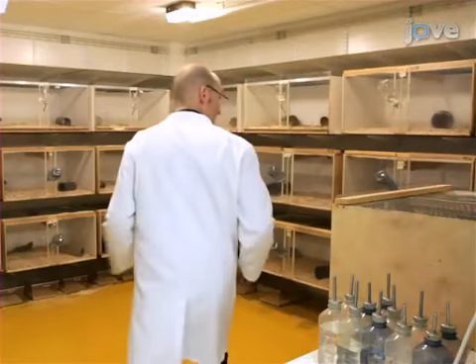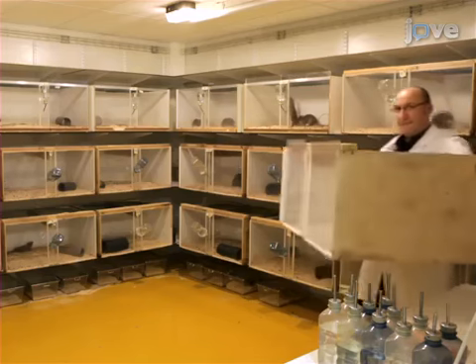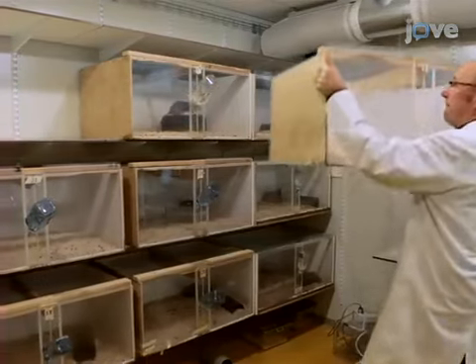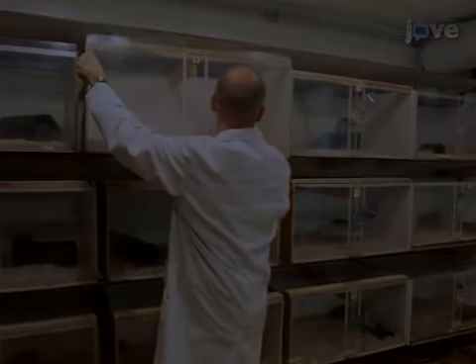Offensive aggression is a highly active behavior, and therefore sufficient space is required for its full expression. For optimal results, use resident cages that have at least half a square meter of floor space. To facilitate developing territoriality and reduce social isolation, house each resident with a female for at least 1 week before the start of the experiment.